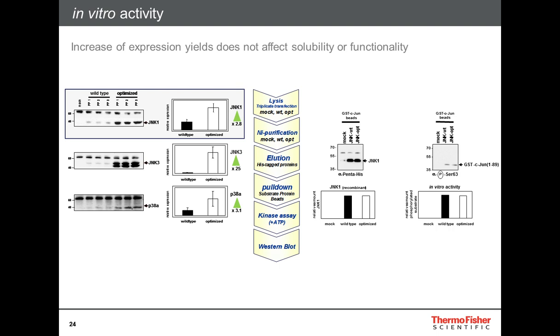And in a nutshell, what we found is that the protein coming from the wild type gene, of course, was able to give a positive kinase signal, but this kinase coming from an optimized gene had the very same performance, which you see on the very right side with a phosphate-specific antibody.